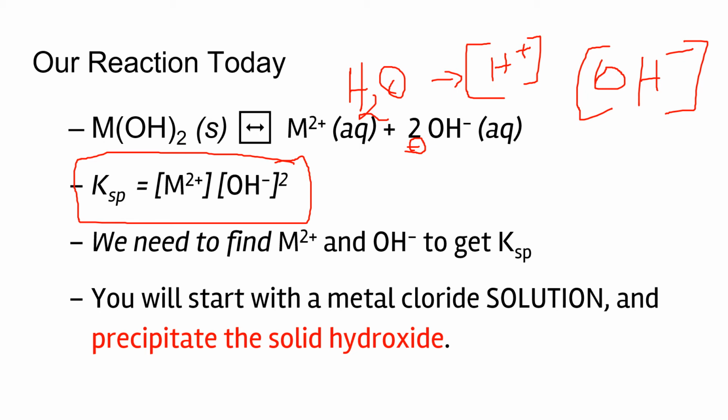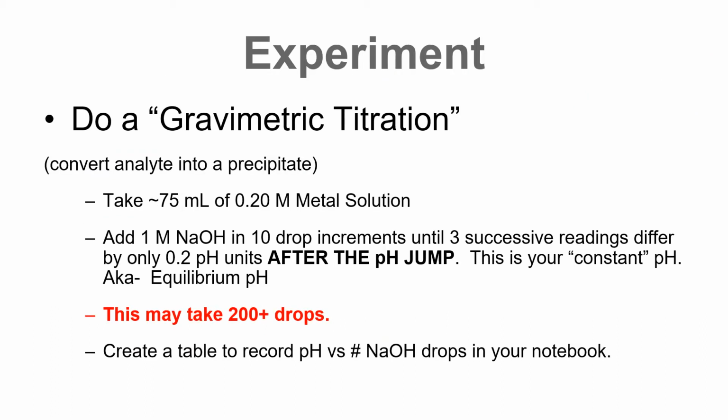And so let's see what happens. Alright, so with the experiment, we said we are going to take pH measurements when adding the sodium hydroxide. Sodium hydroxide, as we said, is the source of the excess hydroxide ions in the solution that enables our equilibrium to go back to the left and form more of the metal hydroxide, causing the precipitation to be observed.